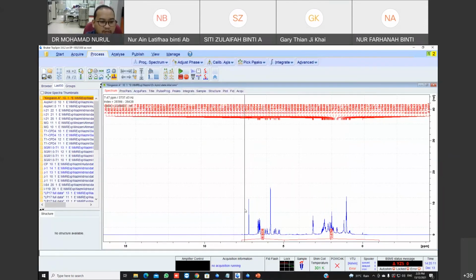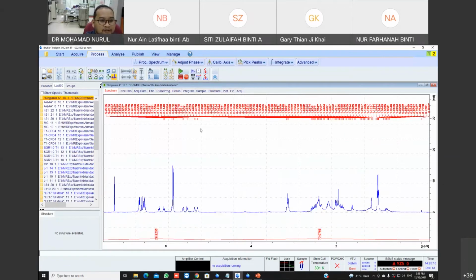Okay, this is a proton NMR for natural product samples. First, there are a lot of tabs here, so we do them one by one. For example, we want to know the integrations. If you remember for KOT 222, kita ada pakai integration pakai ruler kan? Yang nak kira berapa proton this peak, you kira berapa tinggi, and after that, you divide with the smallest one. This one we already do automatically for you.